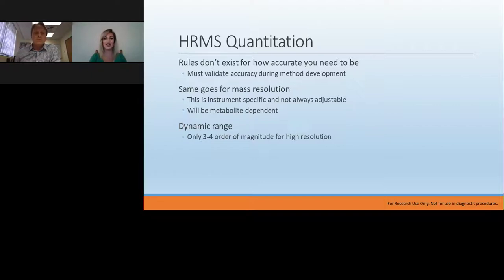And Dr. Garrett, it looks like we have time for one more question. In your tryptophan study, you showed a KEGG pathway with some key metabolites highlighted. Does your approach detect all the tryptophan metabolites? That's a good question. And no is the answer, because some of them are below the limits of detection, as well as some of them are sitting in a noisier area depending on their mass resolution.